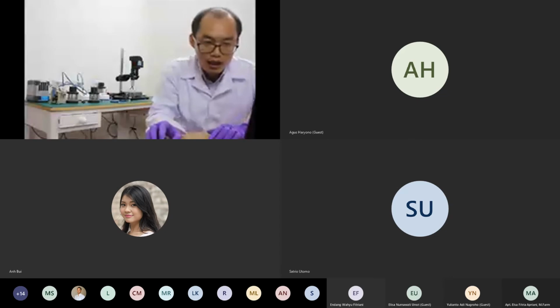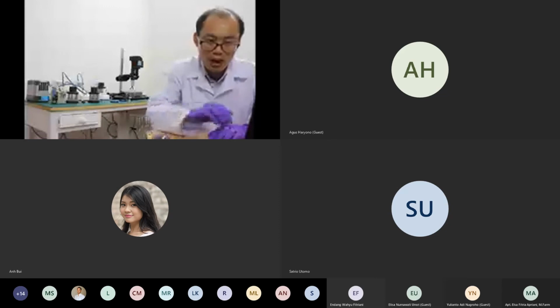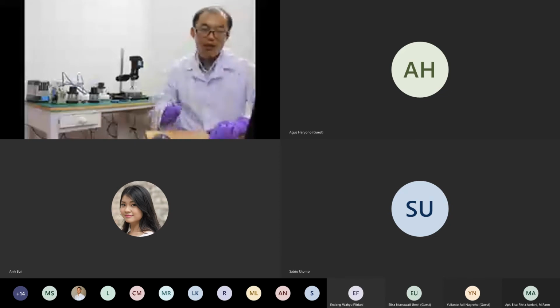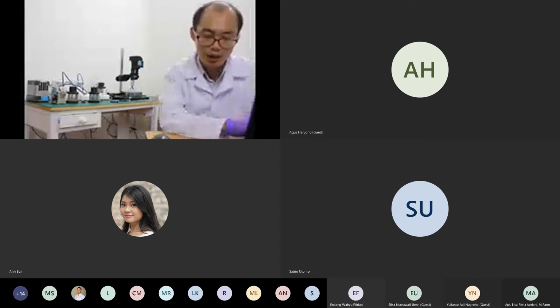Okay, sorry. Can it be used to make a lipid-based delivery system such as solid lipid nanoparticles with nanometer size? Yes, sure. Actually, in the last slide I already showed the application with lipid nanoparticles.